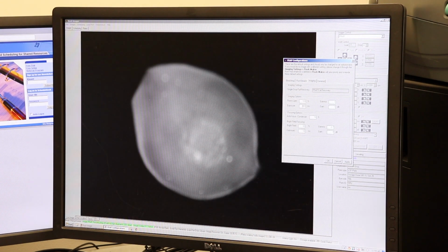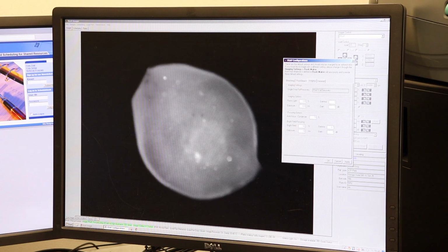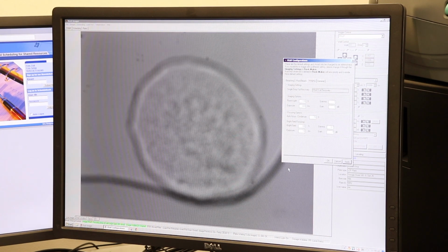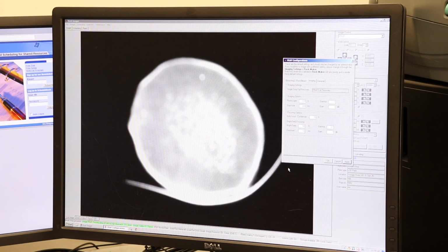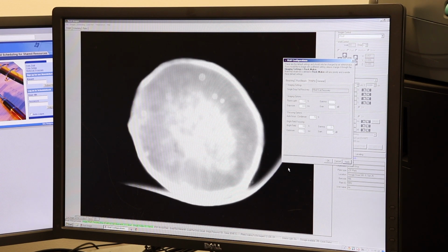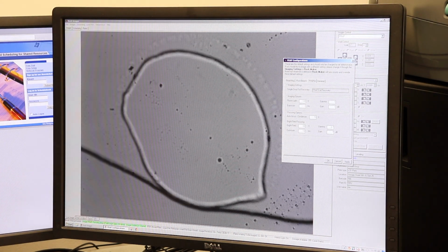So we're going to try a little less, apply. And since this is just the initial imaging where we try to get the fluorescent correct, it's not going to affect the experiment. So maybe a little less than that.